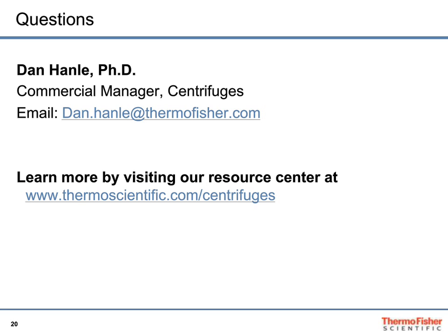And I'll just say quickly, the most obvious example of that is, most of the time you're running a blood bank centrifuge full, 6 or 12 blood bags, but then at the end of the run or when something happens, you'll make a run with just 2 blood bags, the other extreme. That's a much lighter rotor, it'll get to speed faster, and if you just go by timing, you will spin that in a different format. The ACE will kick in in that case, and it will end that run a little bit early, so the same exact centrifugal force was felt by those 2 lone bags as opposed to a full rotor, say, of 12 blood bags. So that's another thing I would look at. It's probably enough to start. Maybe there's other things too.